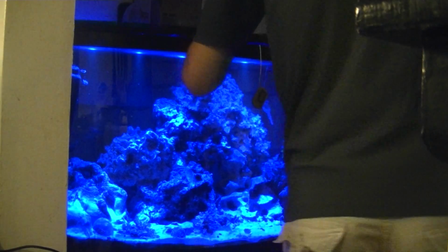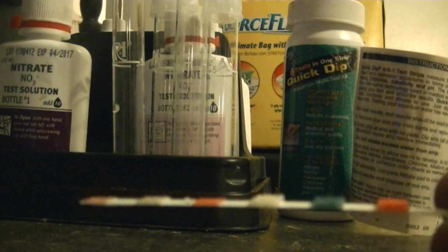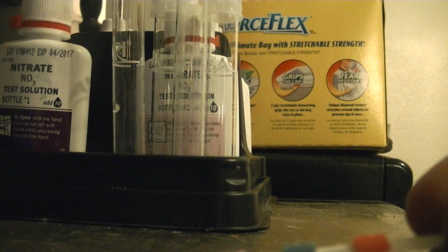So here's the test strip. I'm going to go ahead, turn my camera. There you can see my tank. I'm just going to go dip this. How this works is you wait about 15 seconds with it flat, you put it in there for about a second, take it out, hold it flat, and then you wait about 15 to 30 seconds, and then you test the nitrate versus the little color key they got here.